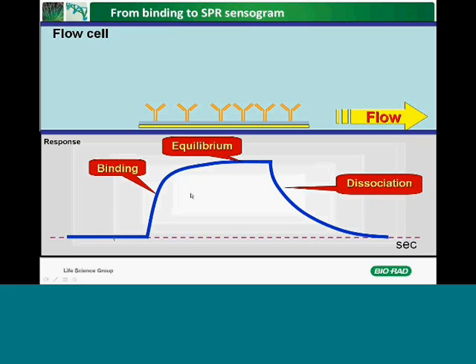And the main thing here is that most instruments available in the market operate in a sequential mode. That is, there is only one needle collecting one sample at a time. So you will need to inject concentration 1, and afterwards concentration 2, and afterwards concentration 3, and so on.